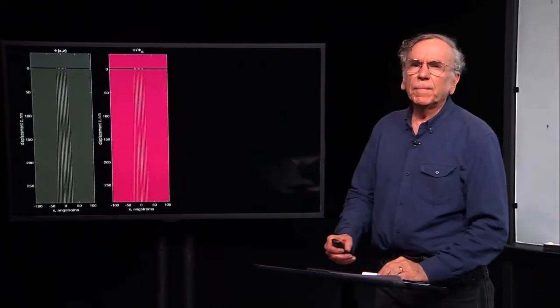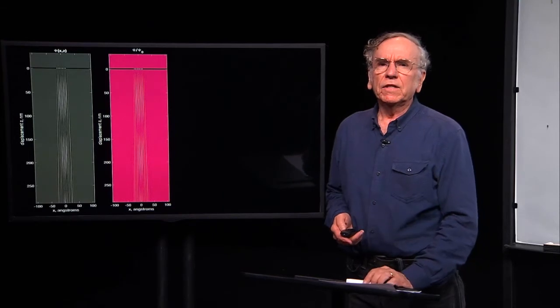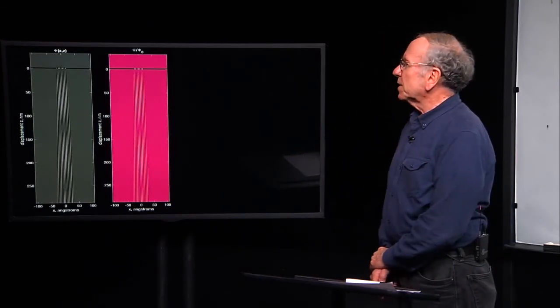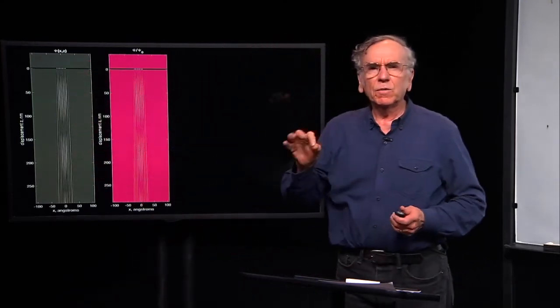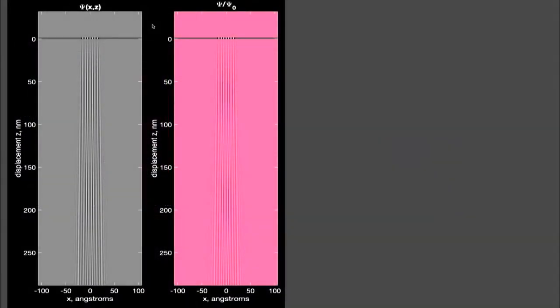The simulation makes use of something called the Fresnel propagator, which is something that we could talk about once we talk about Fourier transforms. So this is the wave function as I showed you before, but here the wavelengths are so tiny that you don't see the colors anymore. You just see the average grayscale part of the image.